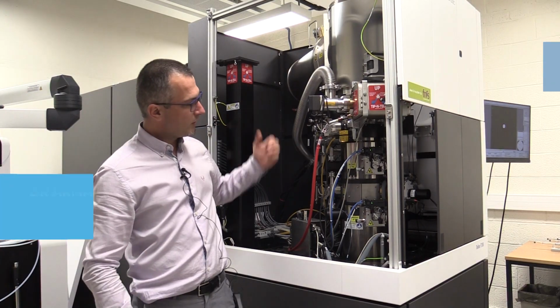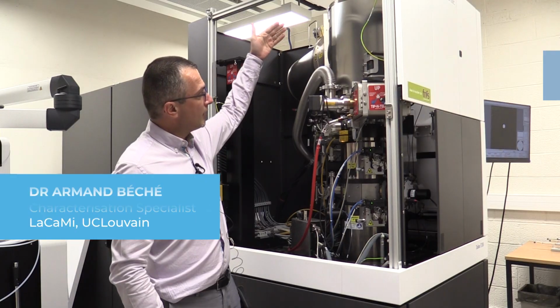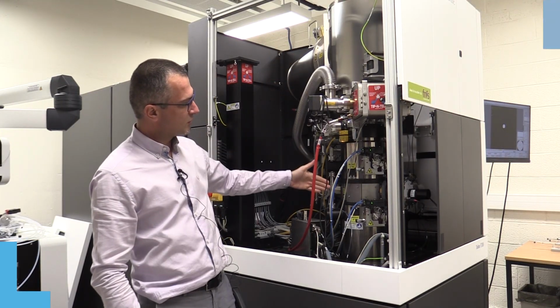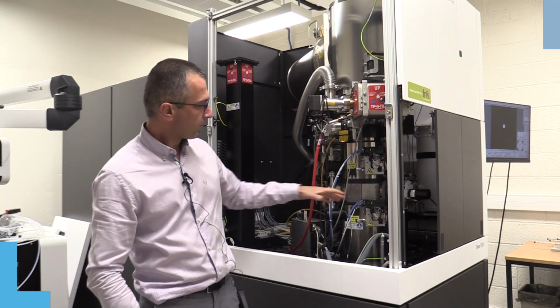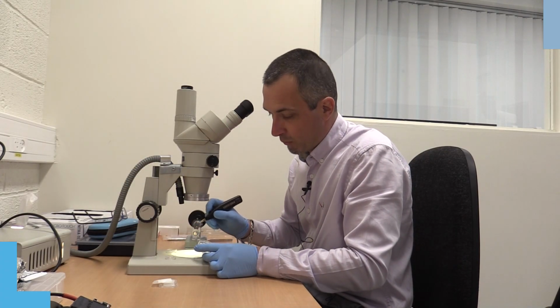Here we have a transmission electron microscope. The source of electrons is located on the top, and it's going to travel through the lenses before reaching the sample, which is about at that level. Here we install the very small sample on the sample holder.